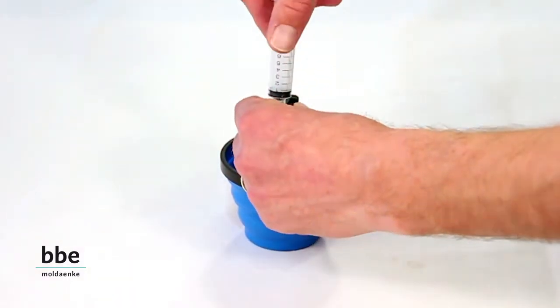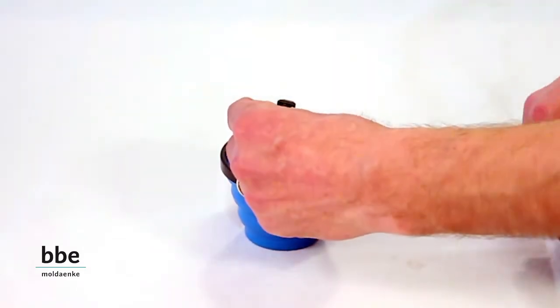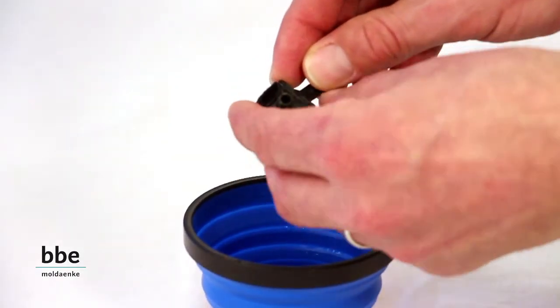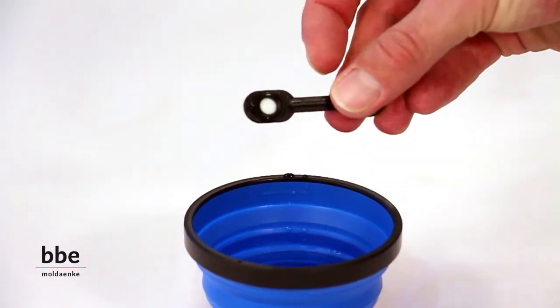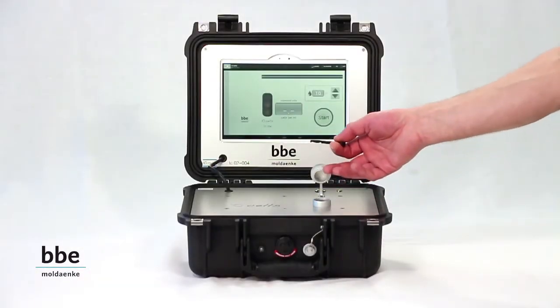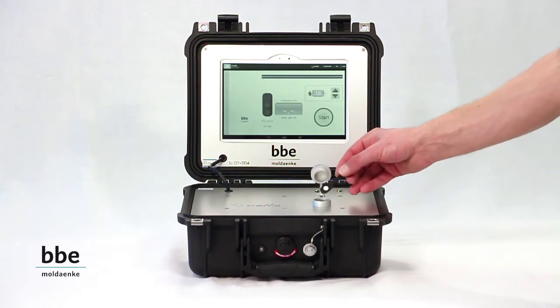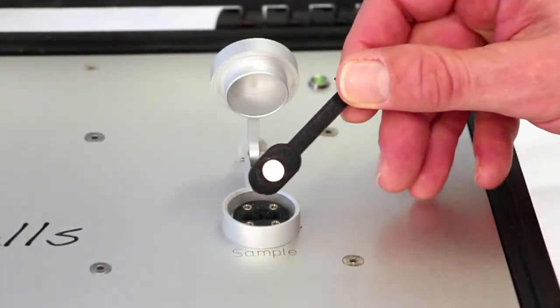After filtration, take the filter strip out of the filter unit. Here you see the TenCells device. Insert the filter strip into the filter holder of the TenCells.